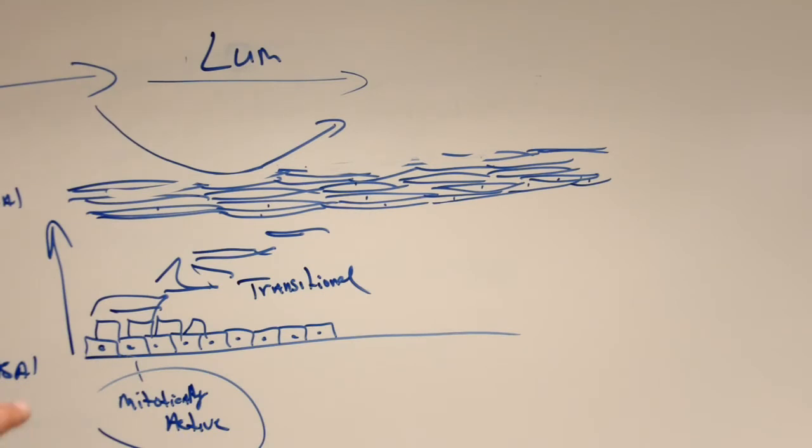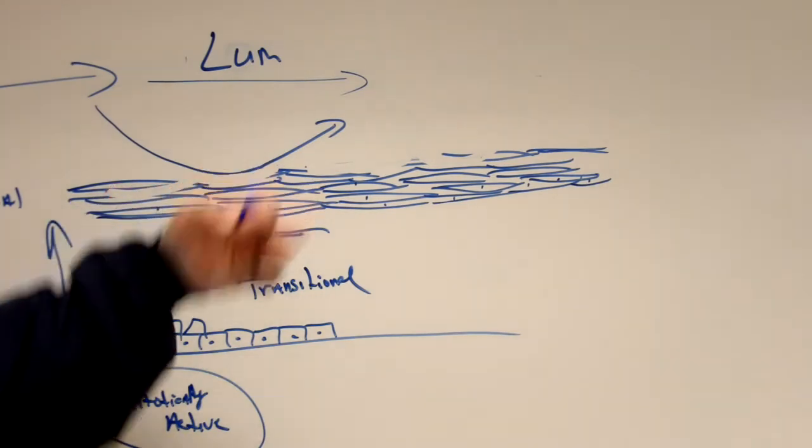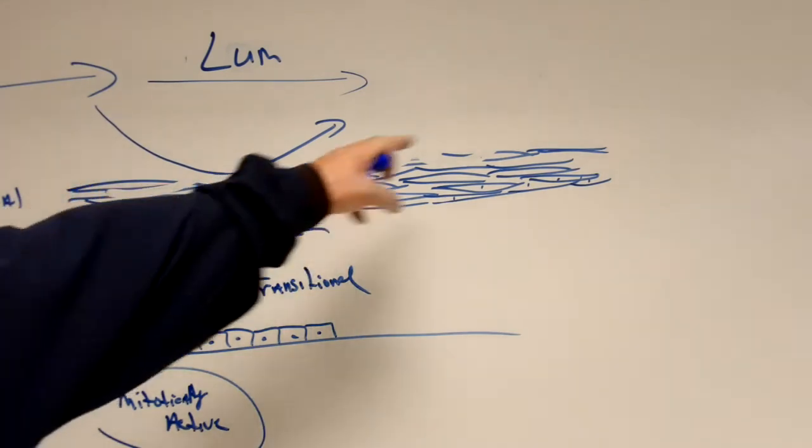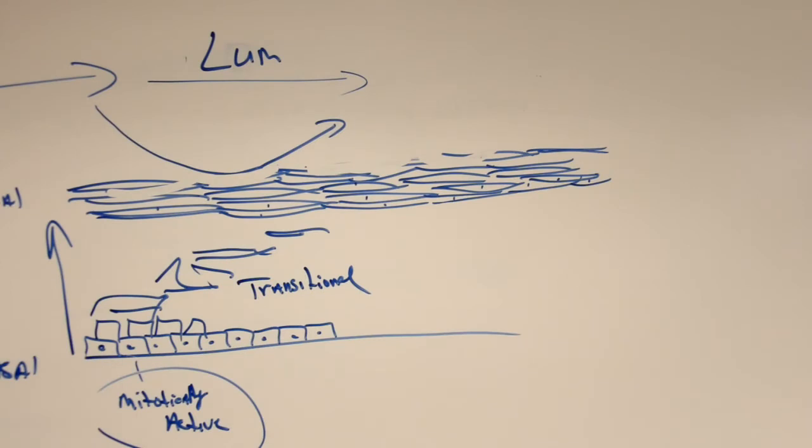Okay? Not to worry, because the basal squamous cells push up, they become keratinized, they flatten even more, and they create this constant seal. This is what happens in your skin. Your skin is basically this type of tissue, stratified squamous epithelium. The palms of your hands and the heels of your feet have way more layers than your esophagus, because abrasion at the surface of your hands and feet is much greater than in the lumen of your esophagus.